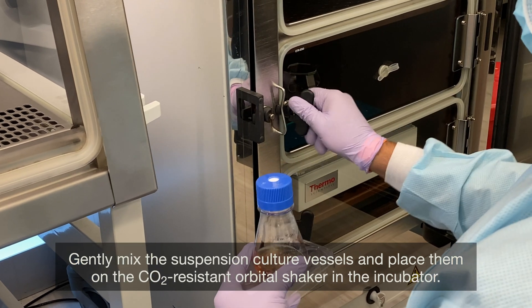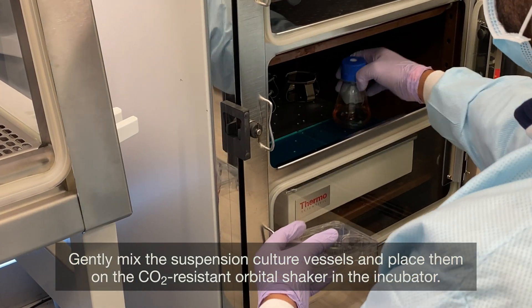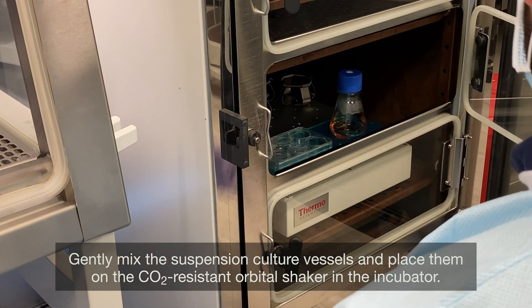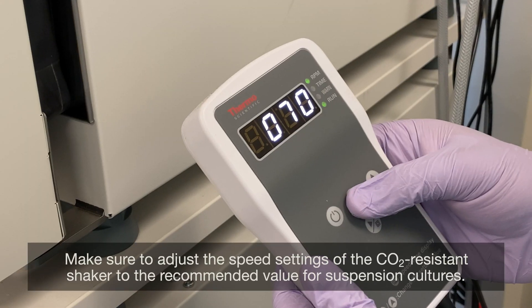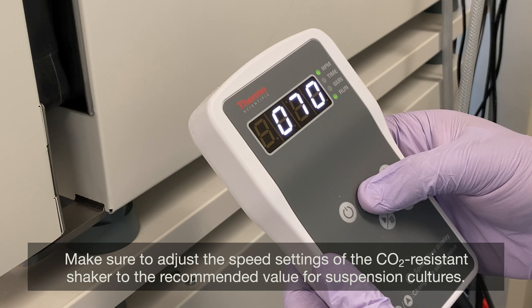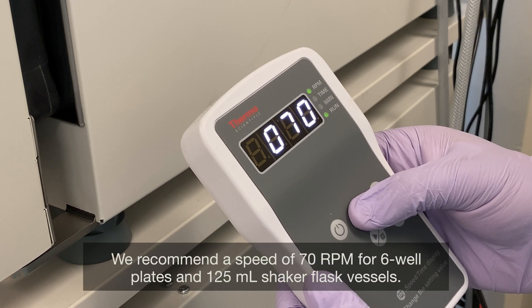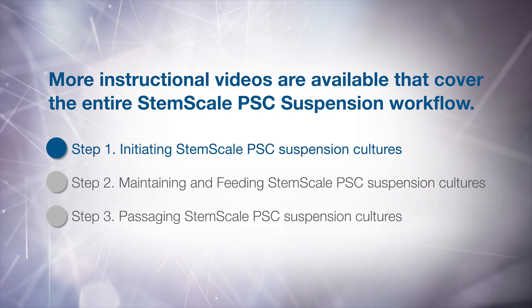Gently mix the suspension culture vessels and place them on the CO2-resistant orbital shaker in the incubator. Make sure to adjust the speed settings of the CO2-resistant shaker to the recommended value for suspension cultures. We recommend a speed of 70 RPM for 6-well plates and 125 mL shaker flask vessels.